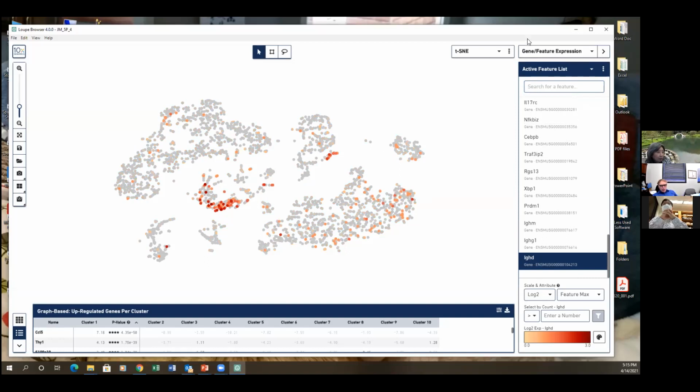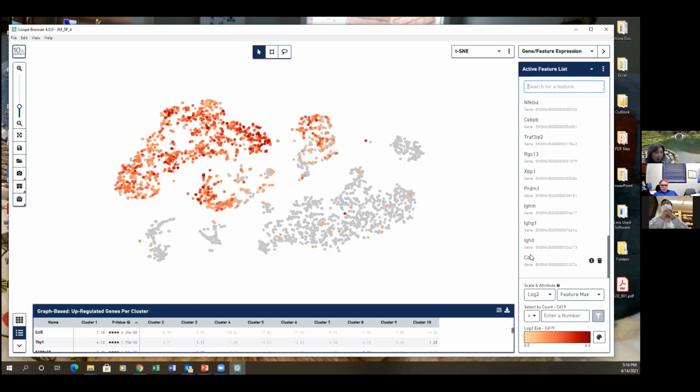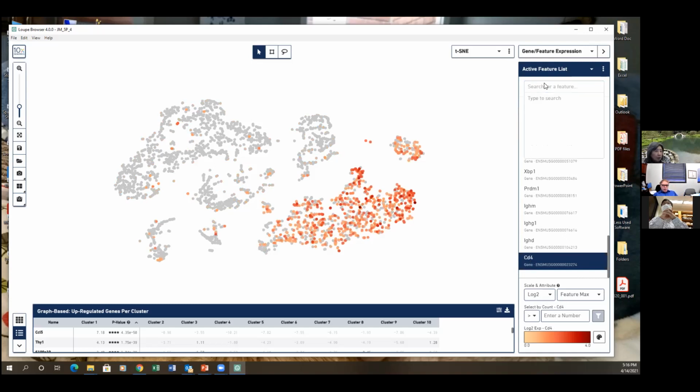Doing CD19. There are some CD19 that got tossed over there. Somehow the shot put some B cells, not too many. How about CD4? And what about CD8? Can you see the difference? CD4 is all over. We did sort these TFH, so mainly they are CD4.